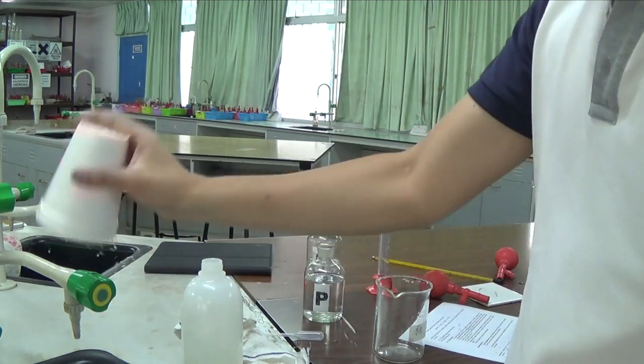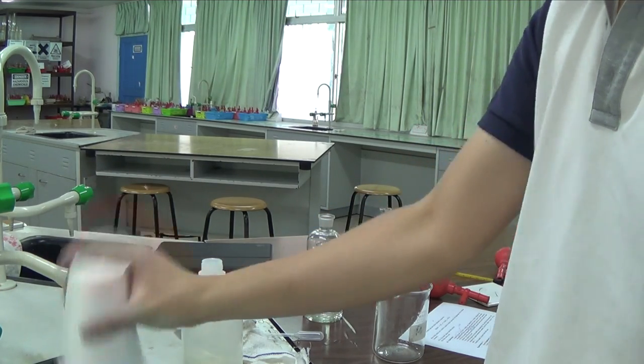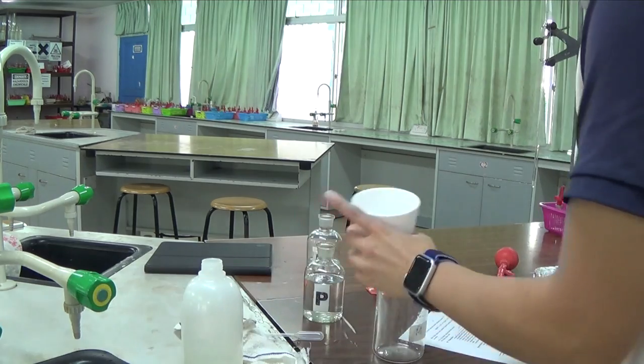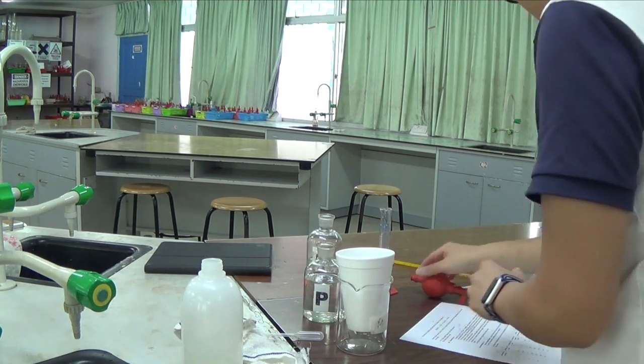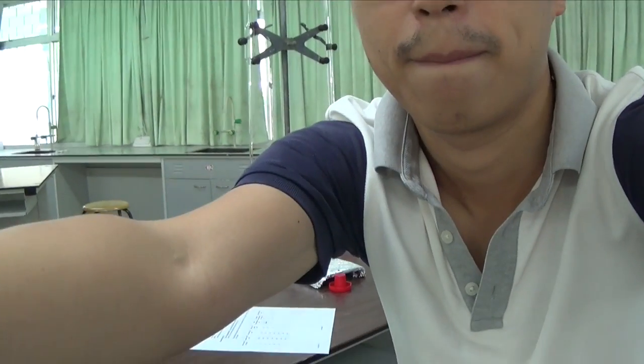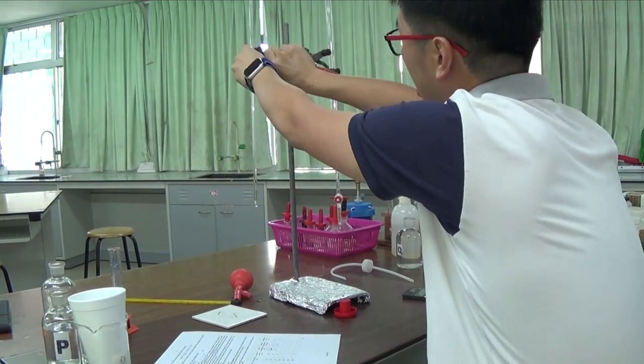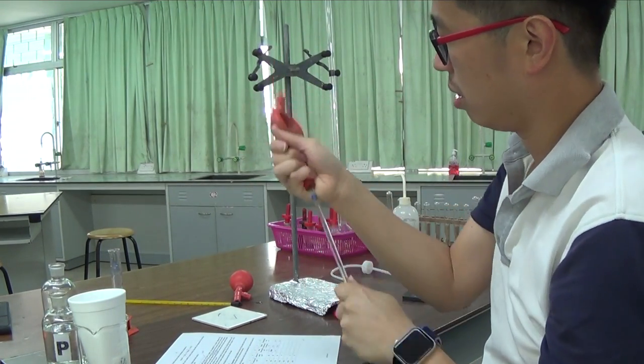Okay. So making sure that as much of the water has been gotten rid of. Okay, put it back in here. Now I have to go back to the pipette thing. I don't know what's wrong with this. Okay, that should be alright now. So going back to the pipette thing, I have to pipette out another.